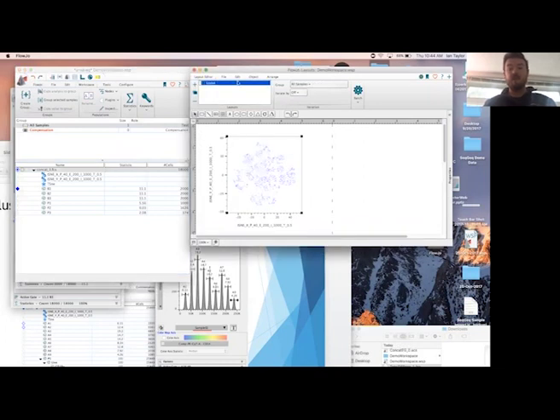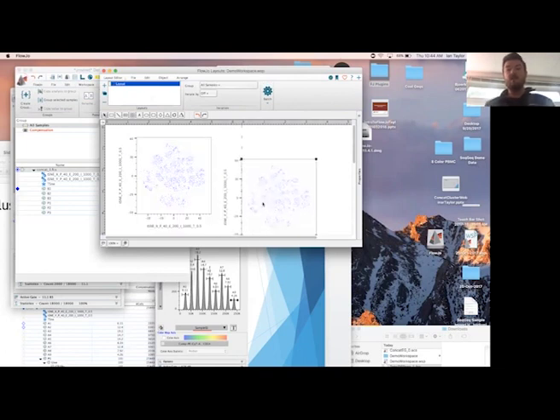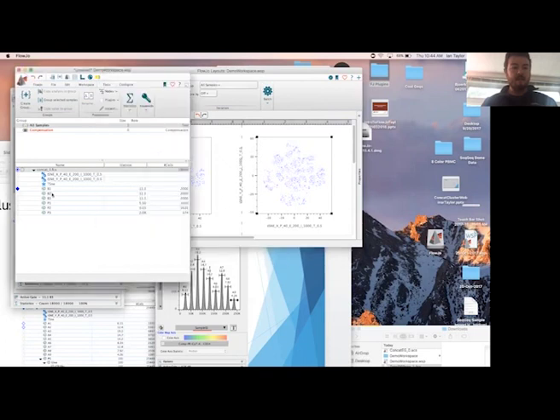And that's great. Now a trick, if we want to bring in a couple more samples very quickly, is to simply hold down the Alt key on my keyboard and then drag this, and that will create a copy of that plot. But if I want to see another sample here, I can just do an overlay. Actually, I might overlay both of these. And then I'll remove the sample I'm not interested in.